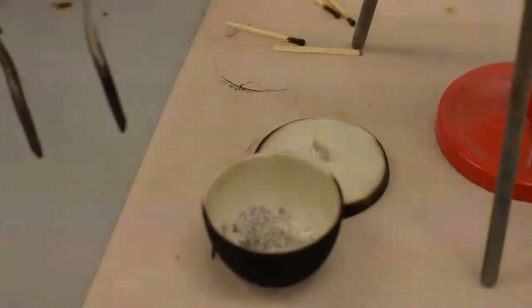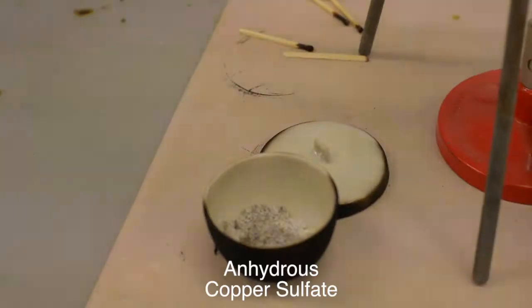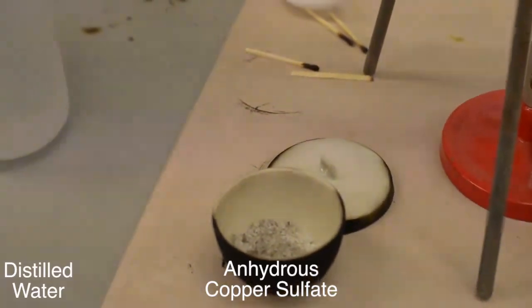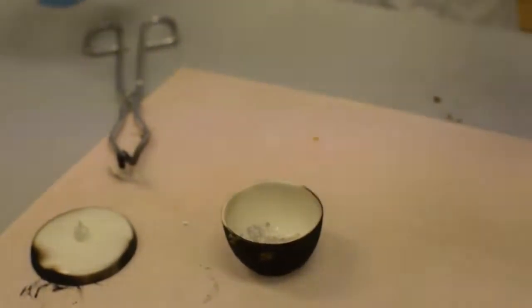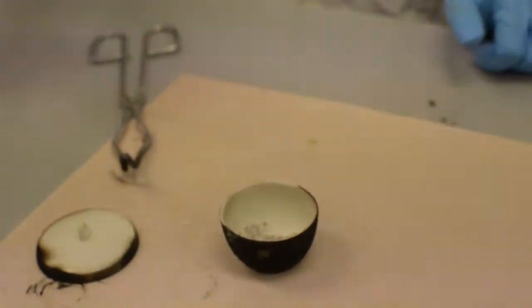About two more minutes later and it's practically completely dry. We've got the anhydrous copper sulfate, and in a second we're going to rehydrate it with some distilled water and note any color changes we can see. We've got the anhydrous copper sulfate and the copper pentahydrate over here. Just going to add a few drops of water.